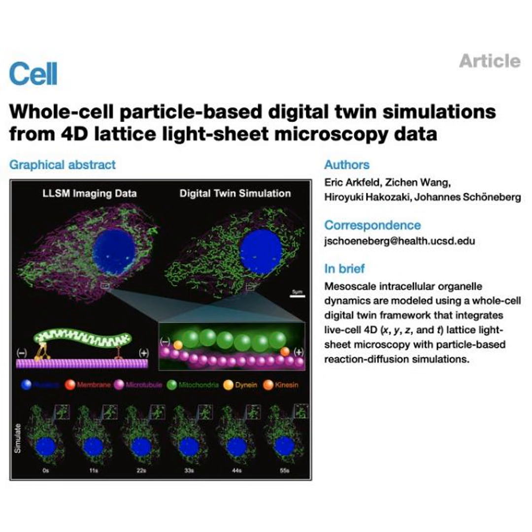That is a very fair point of skepticism, but it's not just a random guess. The RMM algorithm used the spatial intensity gradients from the actual imaging data. What does that mean in simple terms? It looked at the 3D cloud of magenta light. And where the glow was brightest and most concentrated, the computer procedurally drew a track right through the mathematical center of that intensity. It's tracing the most likely physical path based on the density of the light. And crucially, they polarized these digital tracks.